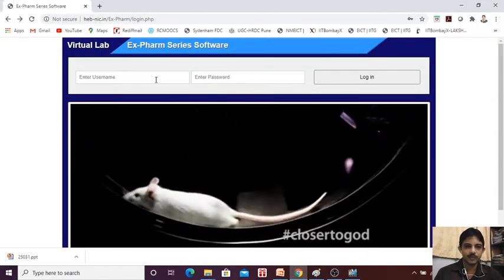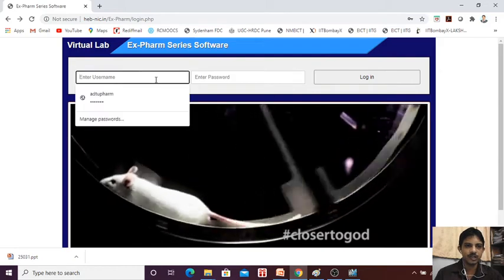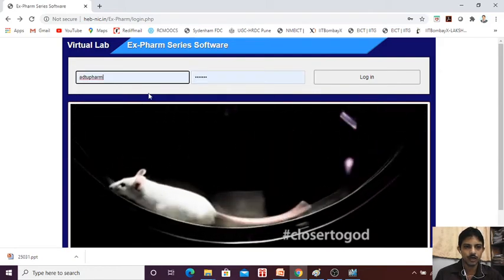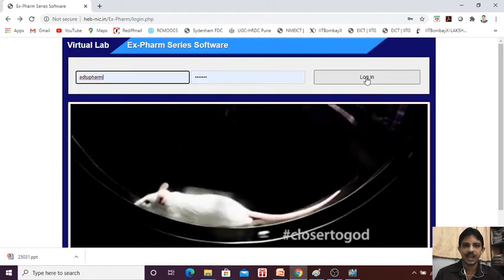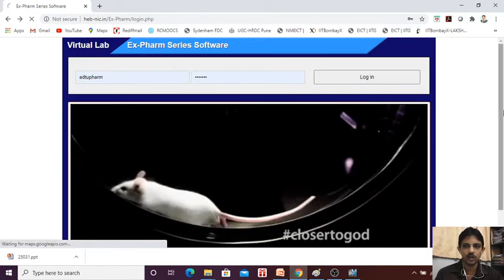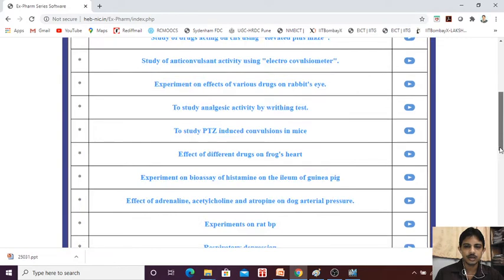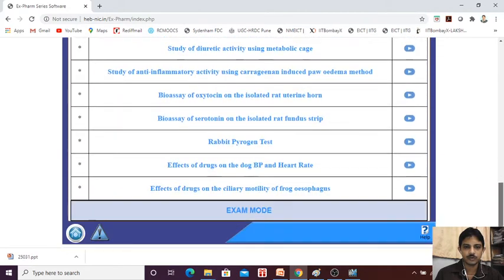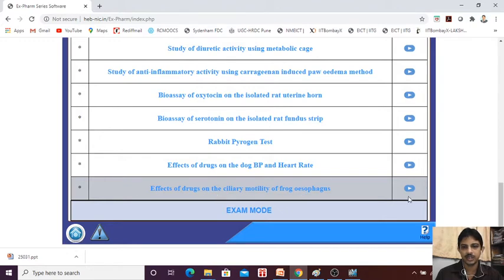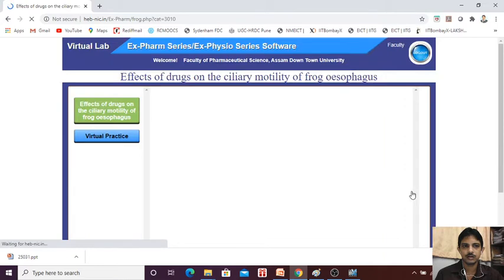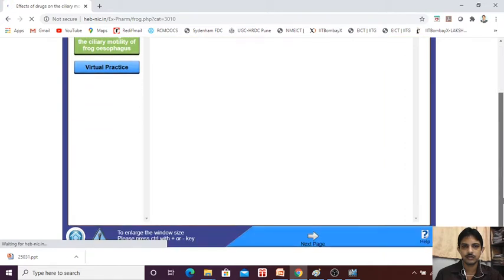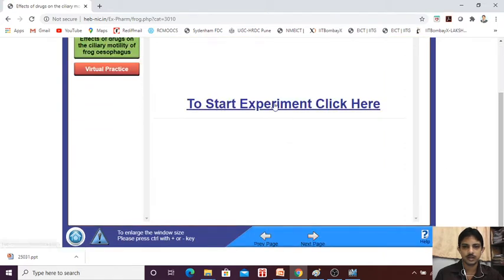We will start the experiment using the virtual lab software, that is the Ex-Pharm software series. After login, we need to find the experiment from the given list. The last experiment is the effect of drug on ciliary motility of frog esophagus. Next, click.